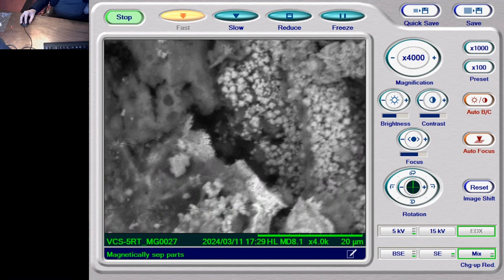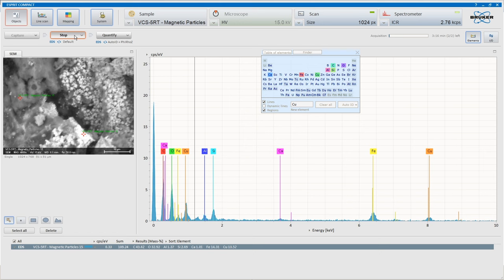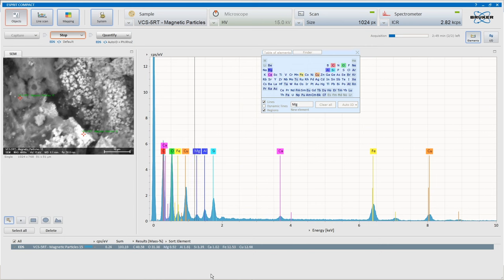Interesting. What is that? And what is this? Let's see. Well, it's this mass of different elements. It has copper in there. It has aluminium, silicon, iron, calcium, carbon. Usual suspects. Looks like it might also have some magnesium in there as well.